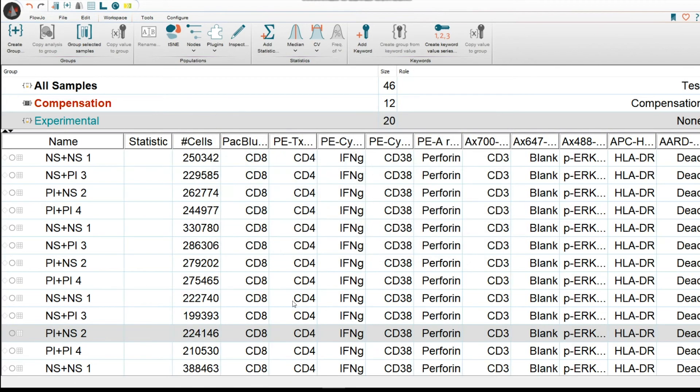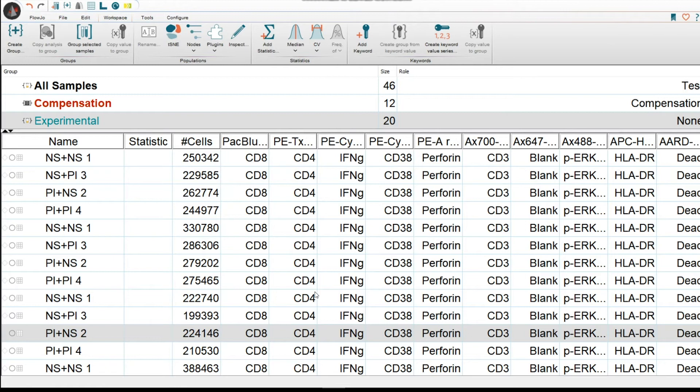click on OK. Then you're going to go ahead and get the different colors that you're using, and then you could label them with the different biological markers of interest. In this case, as you can see here, they're on the screen.